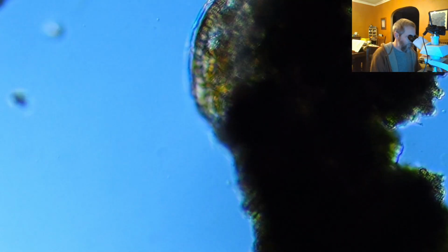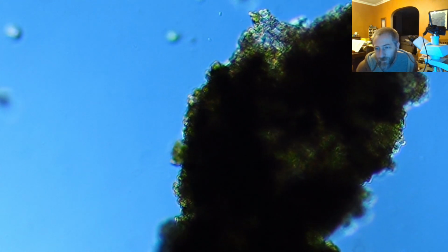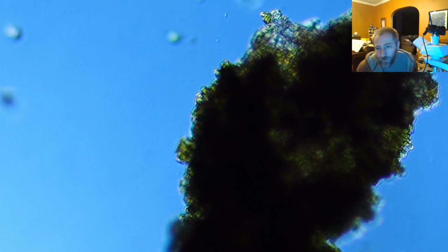Pretty big guy, again. And you can kind of see that they will clamber around on this stuff, and that algae that's in the lichen is part of what they eat, I think. So, does it use its mouth to pull itself up? I think it mostly uses its foot, but it sometimes will grasp, or seems like it's grasping on with its mouth a little bit. Mind of a Snail, hello, how are you doing?